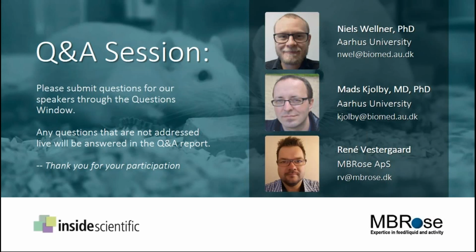That's a very good question, Martin. The system, as I have been told by Renee, has no limit at all. So you can fill it up. But I would say that the limit depends on genotype and how much food they would actually need to eat. My experience is 4 to 6 males at maximum and up to 8 females in the cage. If I go much higher, I start getting tail bites, and that's an indication of too many animals in the system.